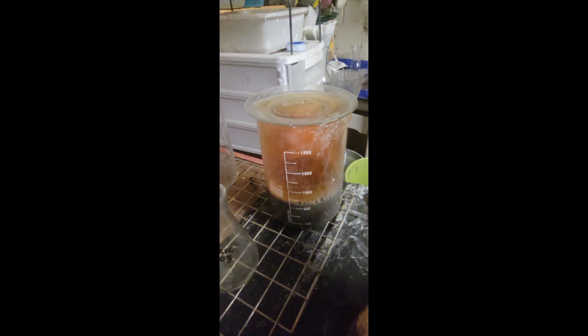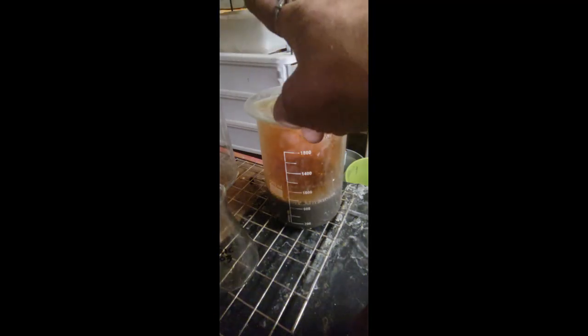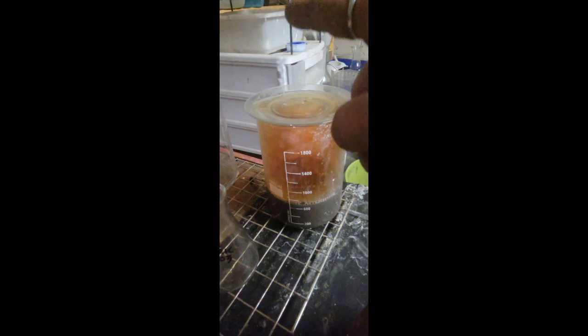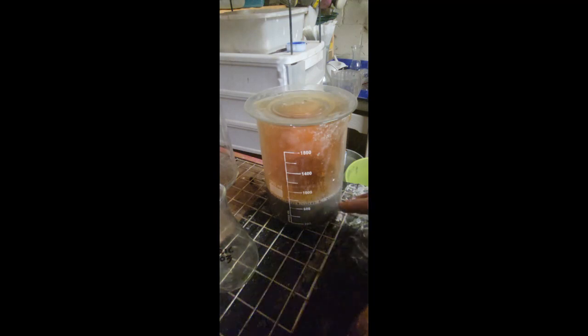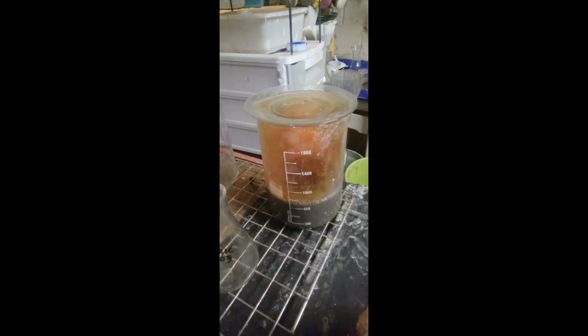Once this has been converted, or dissolved rather, you're going to watch my other video up here, okay? That one. Watch that video, because that stage there will convert your solution here into the silver that we're going to hit with the flame, all right?